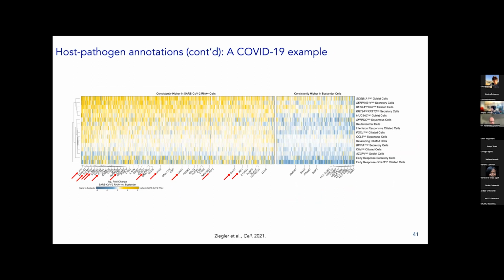The question in the chat is: single-cell RNA-seq will pick up pathogens that are polyadenylated as well as the human RNA, so how could you distinguish between transcripts if you're looking for host RNA? We will capture all of them. And when you sequence, we normally align to a genome. If you only align to the host genome, the pathogen transcripts will likely just get filtered out and will not map. So normally what we do is create a hybrid genome, which is the human genome plus the pathogen genome.